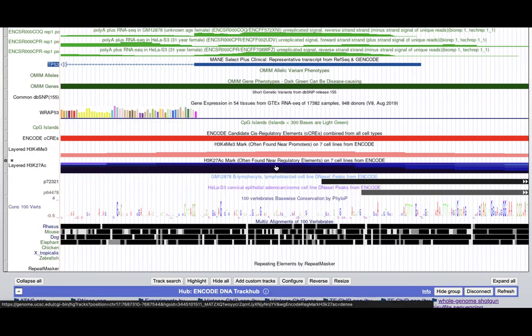The GM12878 usually shows a stronger H3K4 methylation peak and hypersensitivity, which supports active transcription, again, due to this darker band here. Whereas the HeLa S3 cell line didn't show as strong marks here due to the lighter shade of gray. And this can support the idea that promoter silencing is slightly stronger in the HeLa S3 cell line.